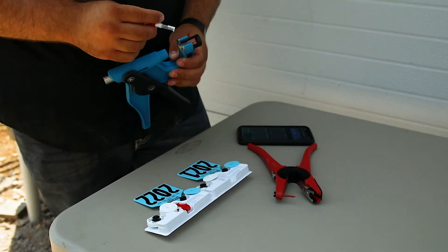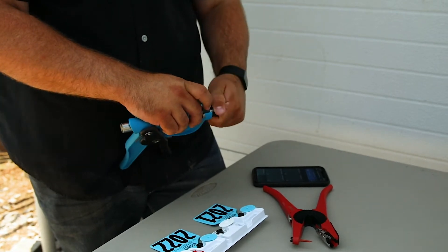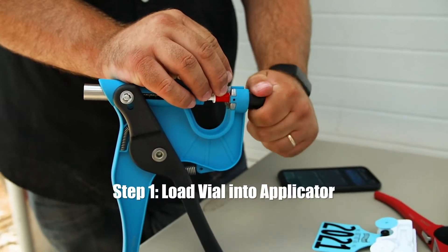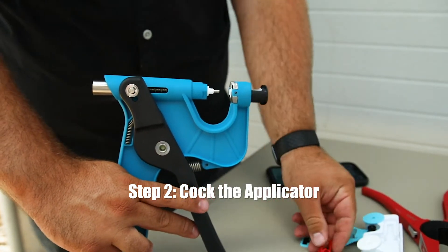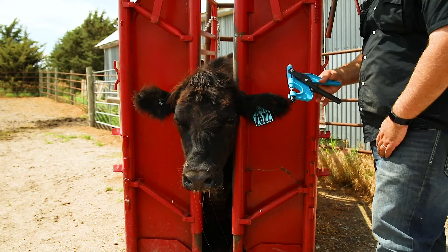TSUs enable you to capture a clean sample of high-quality DNA while you have an animal in a shoot. To use a TSU, first load the vial into the Allflex TSU applicator and rotate the drum to lock it in. Next, cock the applicator. This loads the cutter and enables you to remove the red plastic divider. Now you're ready to go.